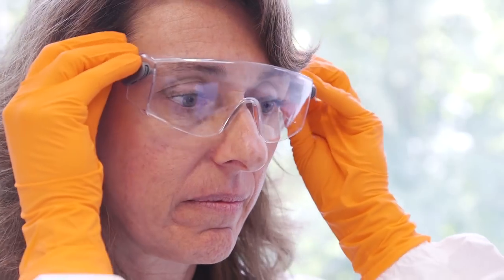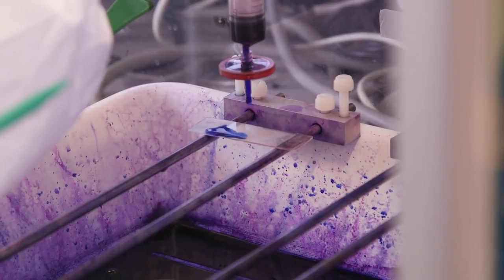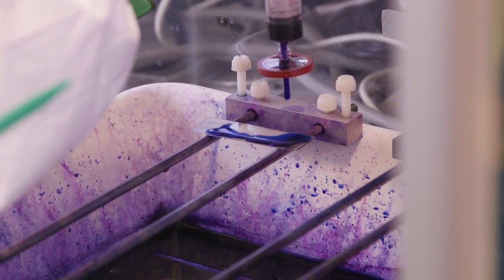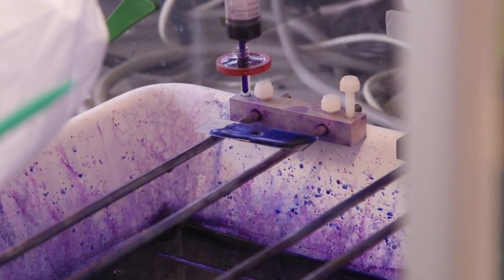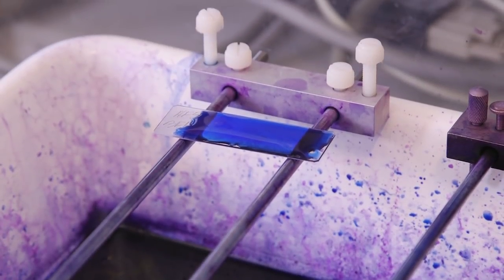Then the slide needs to be fixed and stained with Giemsa, which is a blue colorant that will allow us to see the red blood cells and the parasites on a microscope.